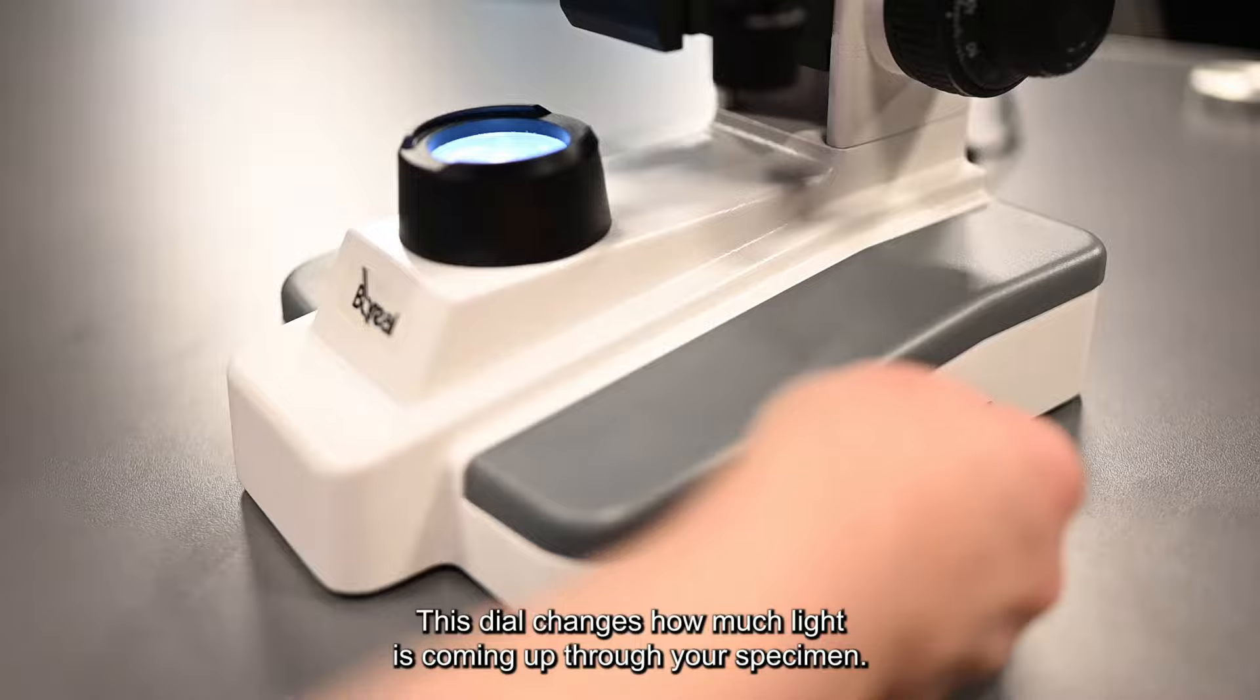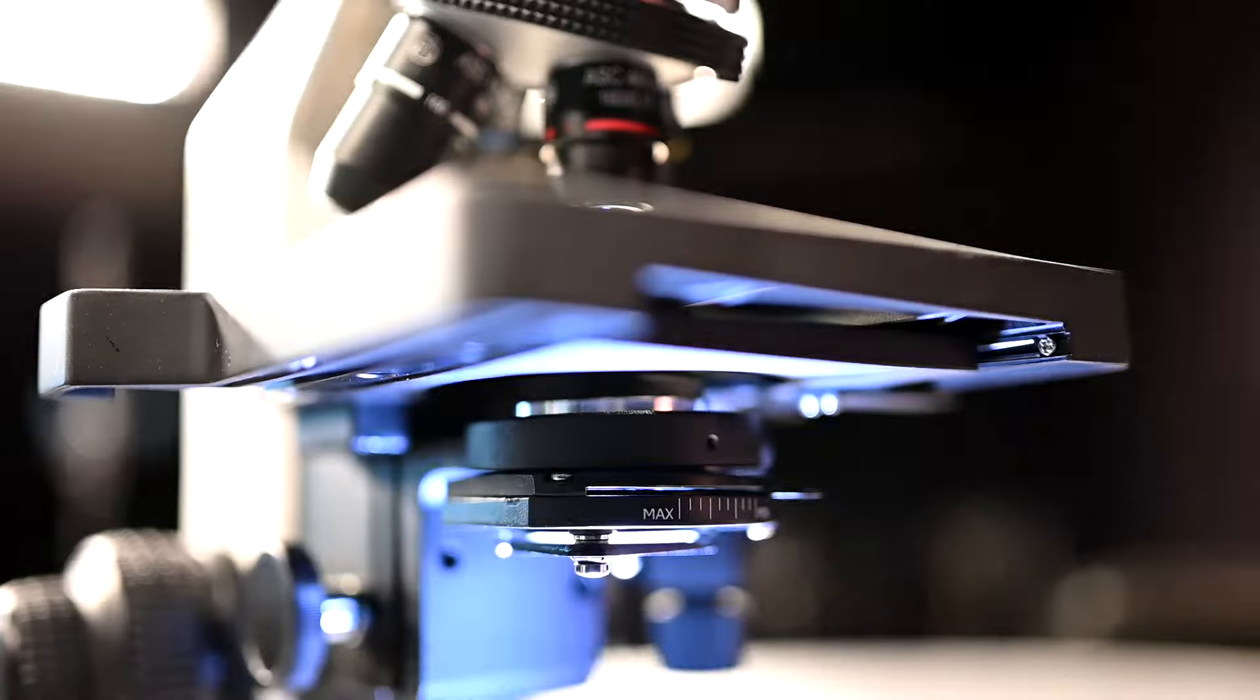On the side of your microscope you'll notice a dial. This dial changes how much light is coming up through your specimen. You always want to make sure that you have light coming up through your specimen.